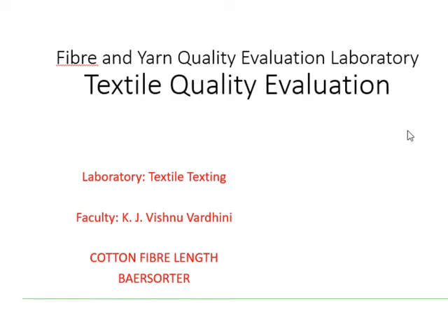Before going into the experiment, I will try to explain the need for cotton fiber length testing.